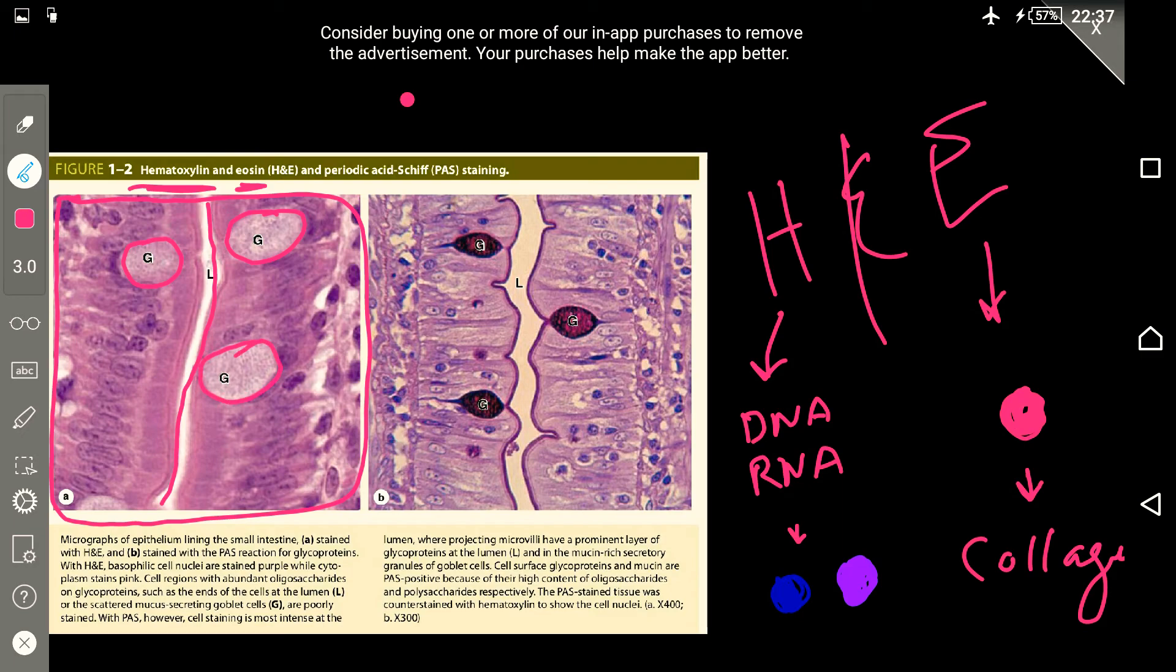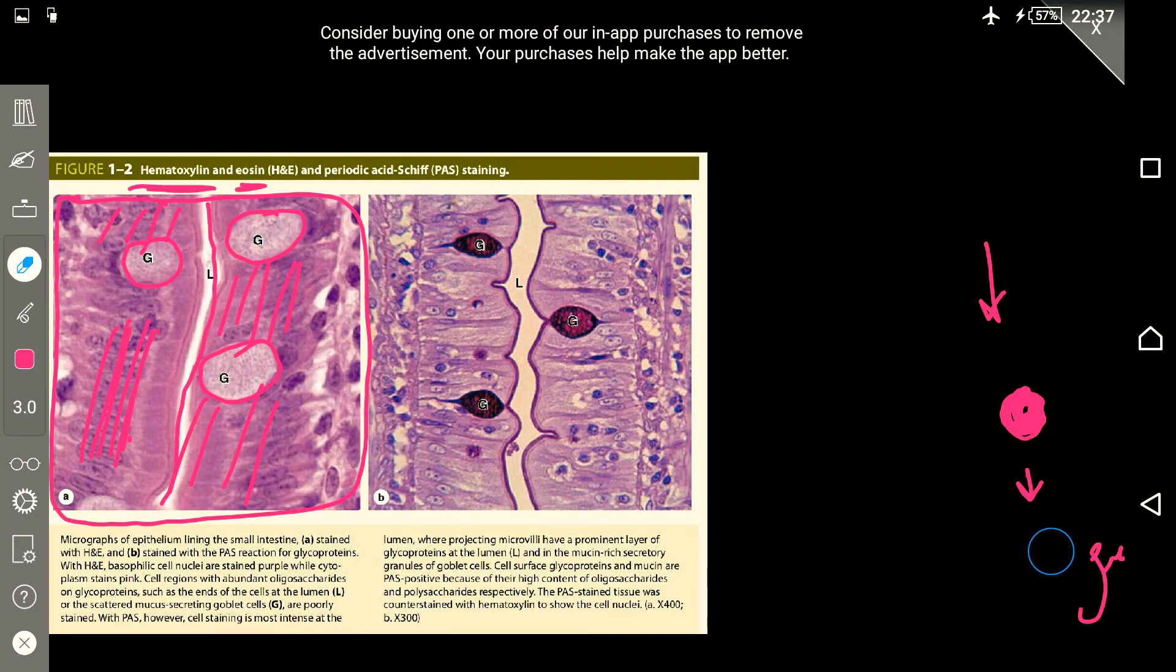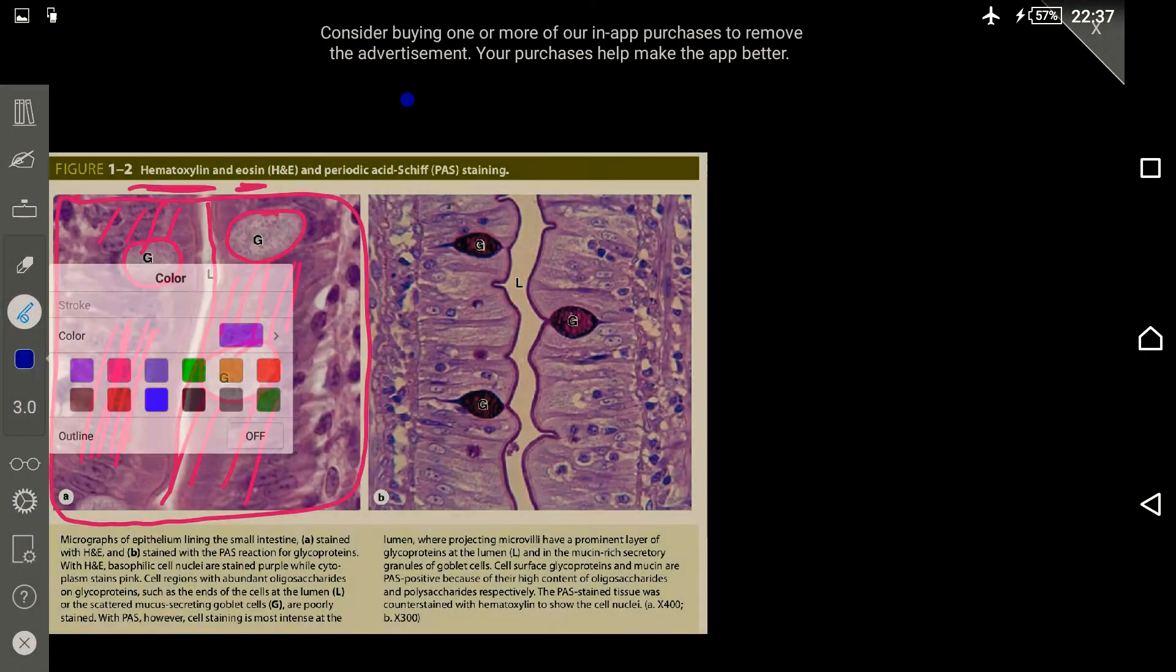G shows the goblet cells which are secretory cells, and also these other areas are the cells lining the walls of the intestine. This is the hematoxylene and eosin type of staining. We have another type or method of staining which is a little bit complex but is mostly used.